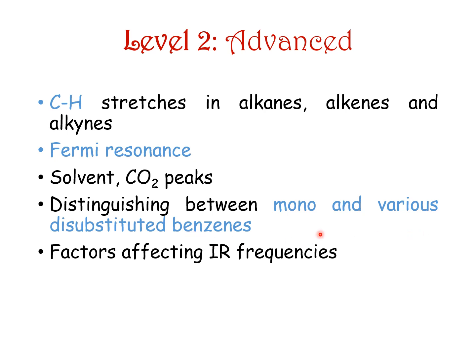All the information which we have just seen is the ideal case condition. There are a lot of factors which affect these IR frequencies. So these numbers are not fixed. They can change based upon the chemical environment, and that is the beauty, in fact, because if you are carrying out some synthesis wherein you are changing the functional groups, then you will easily be able to see the effect of the new neighboring groups on your structure.